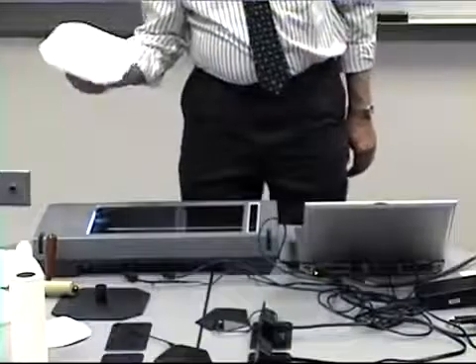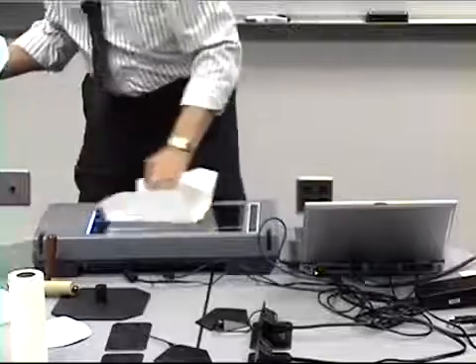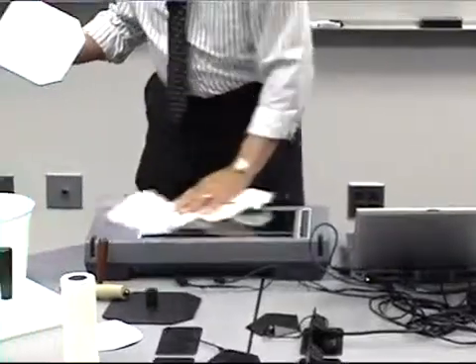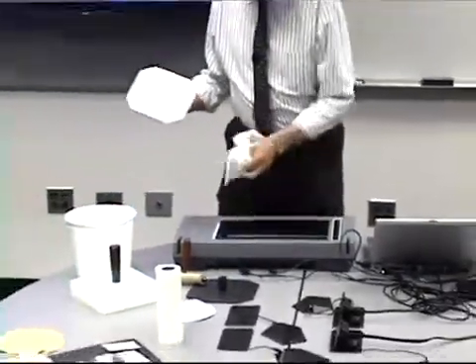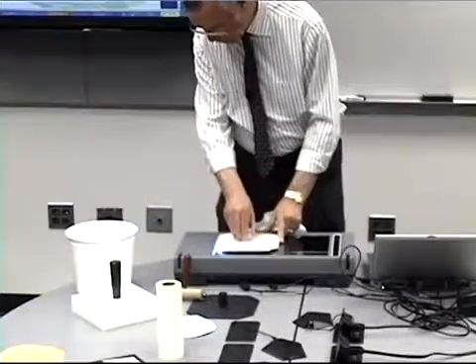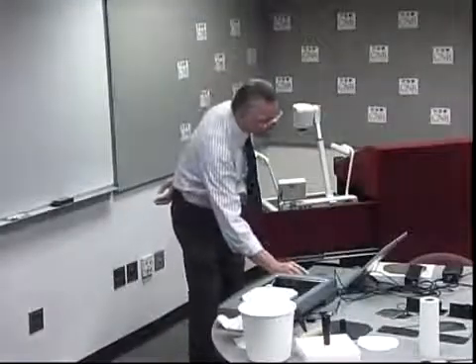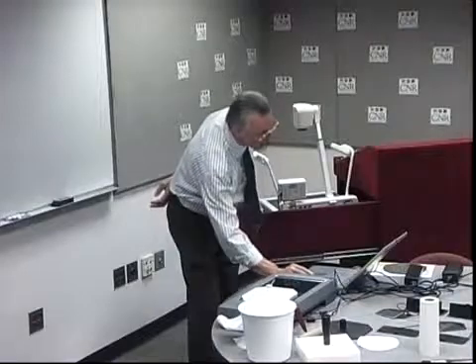Very quickly, a review. Imagine this is a blotter paper, and this is the wet hand sheet right off of the couche roll from the hand sheet mold. And we scanned it in, and we can very quickly diagnose the system. Now, as I mentioned, we're recording all of the steps in the process.